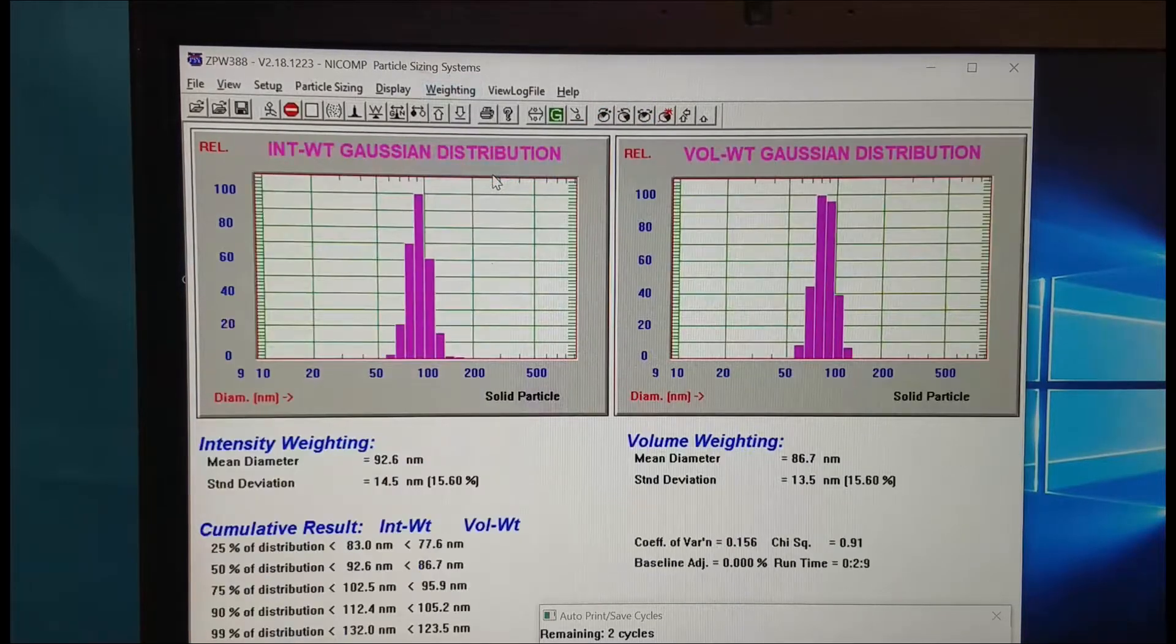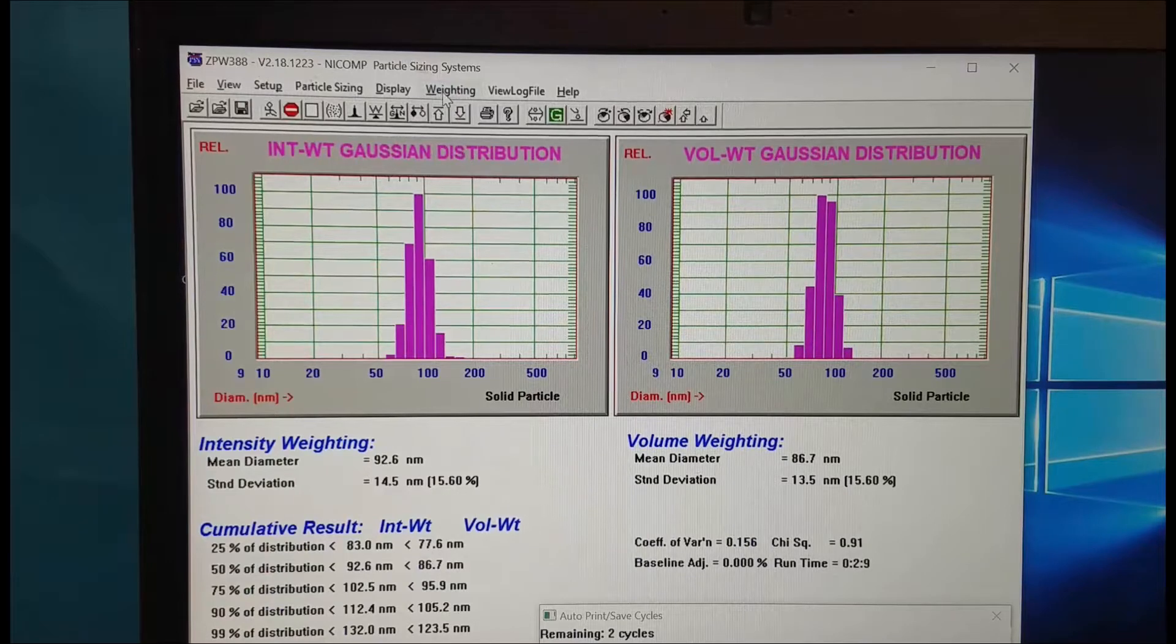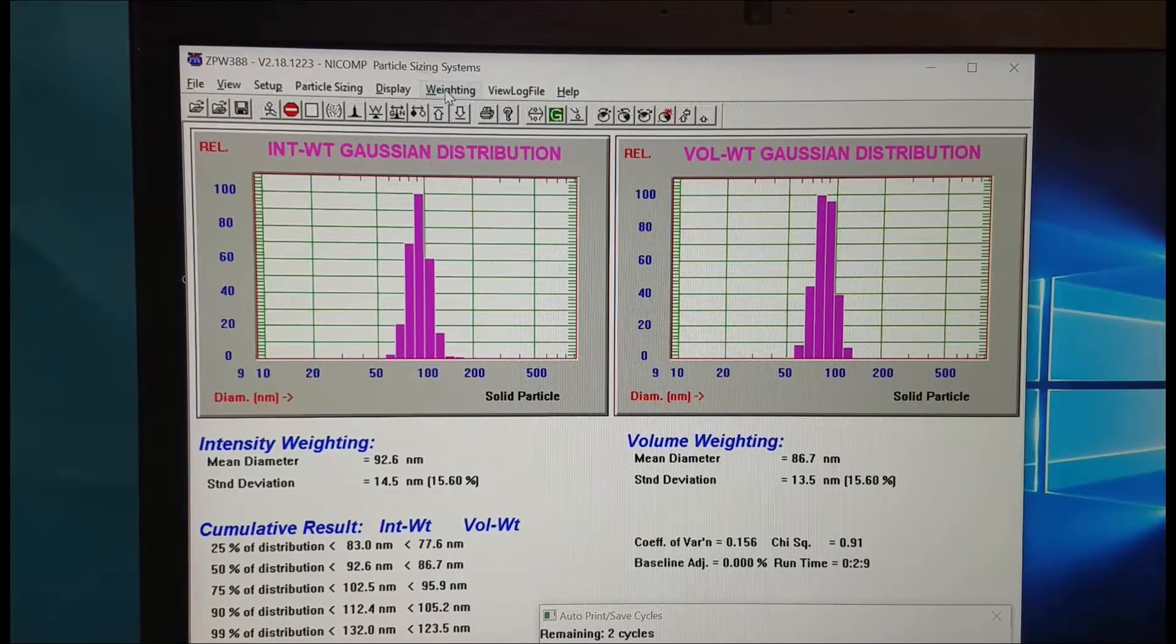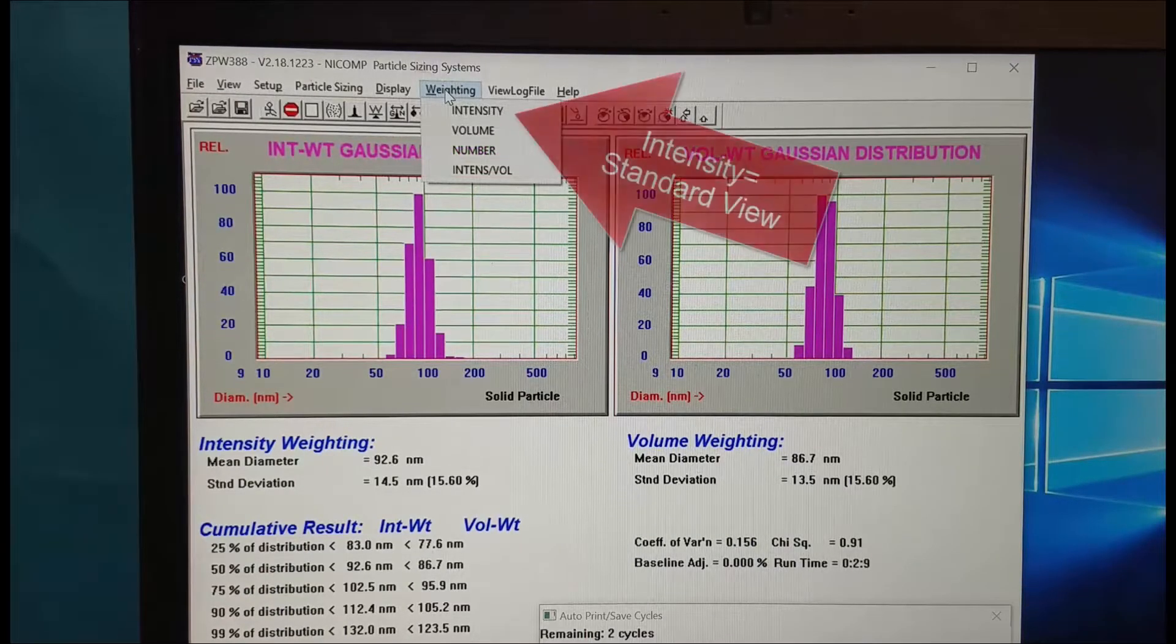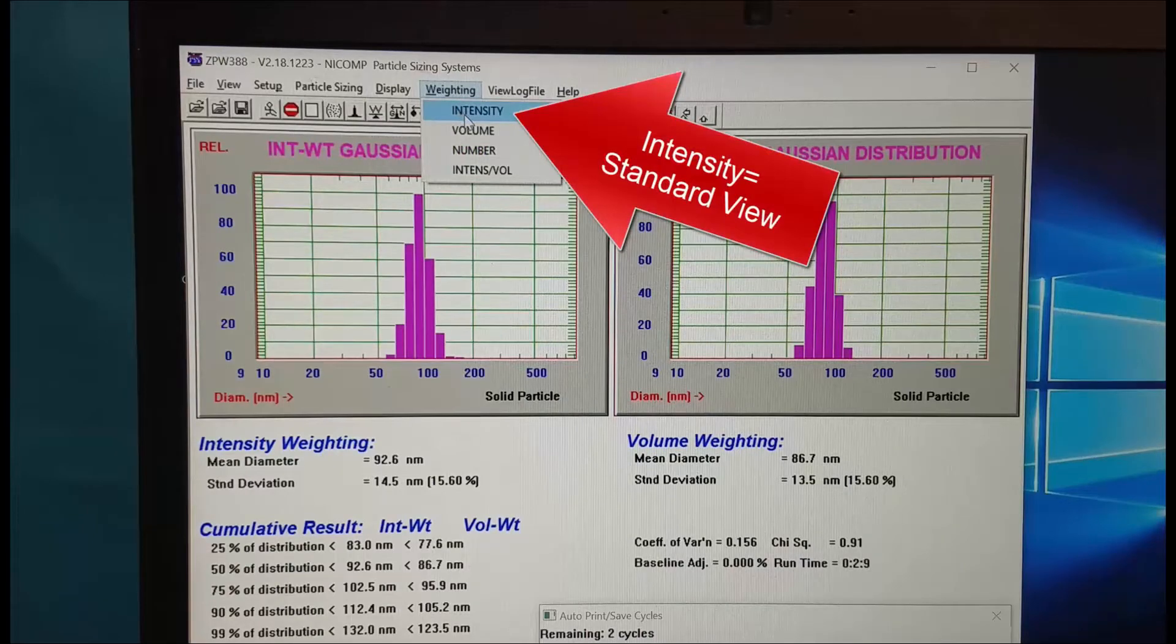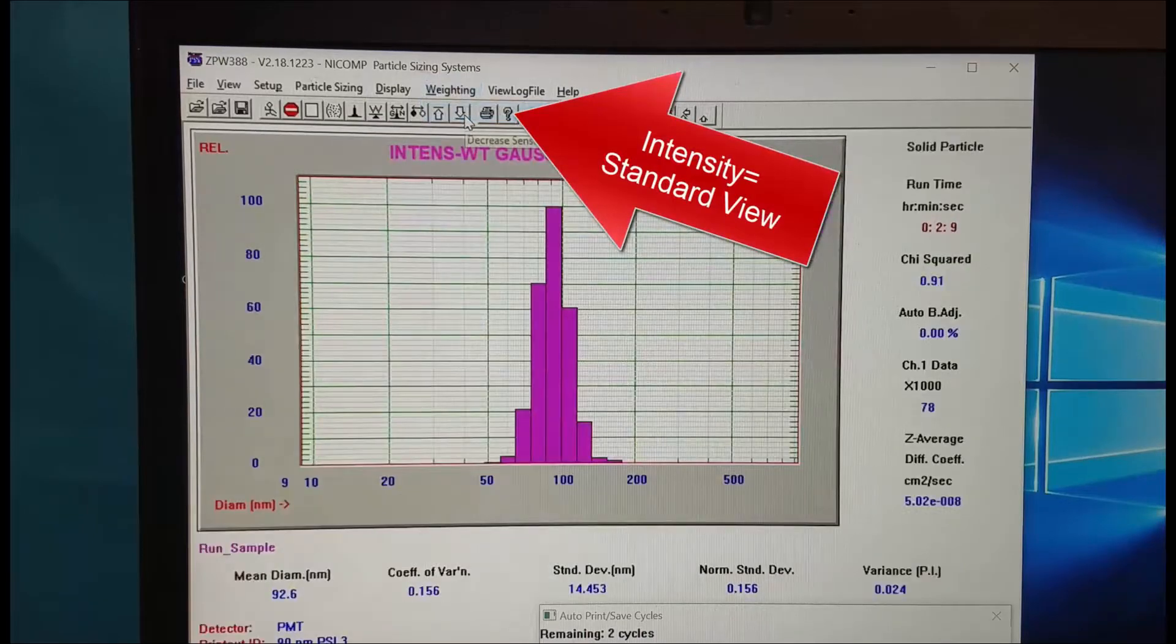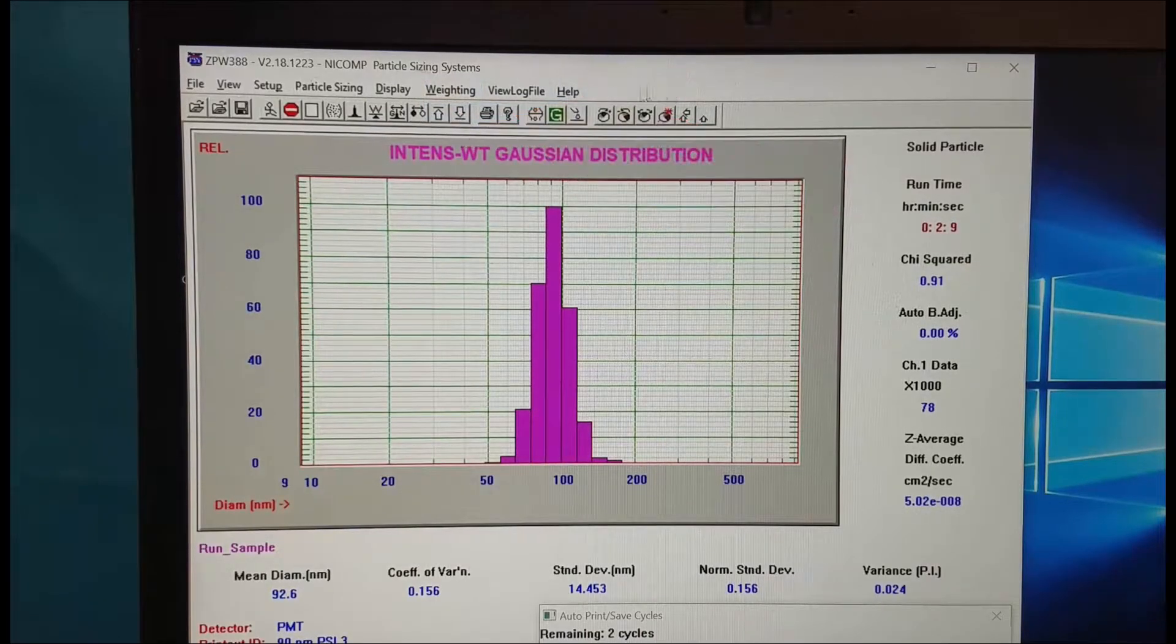Here we can look at both the intensity and the volume distribution. We'll come back up and we'll come back to our usual look, intensity distribution.